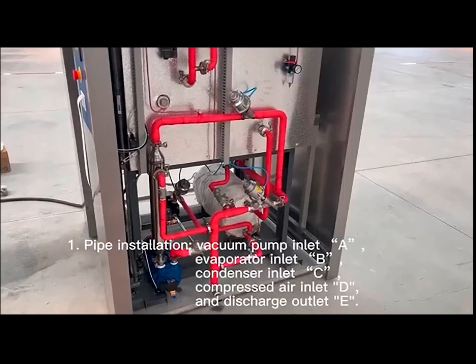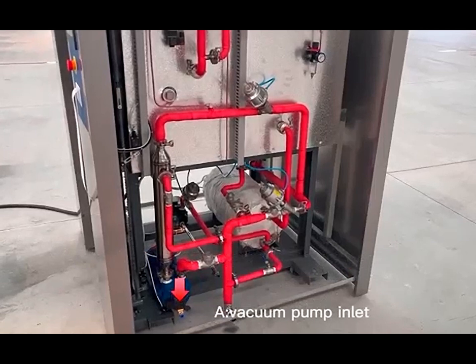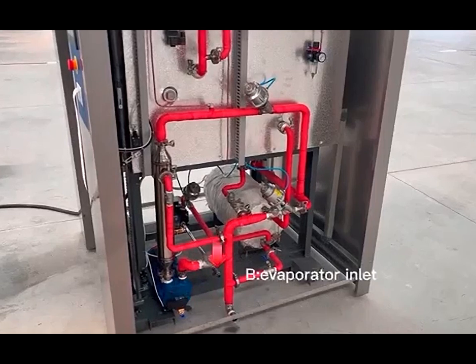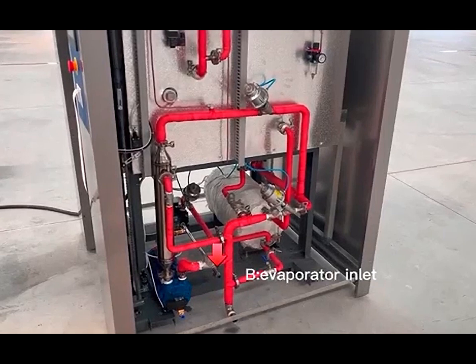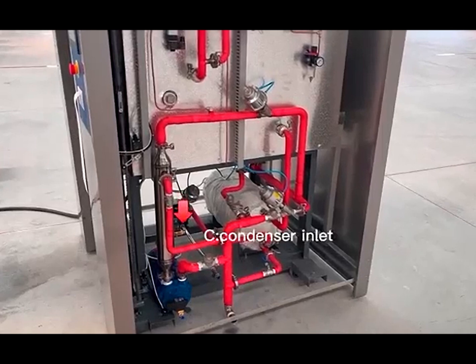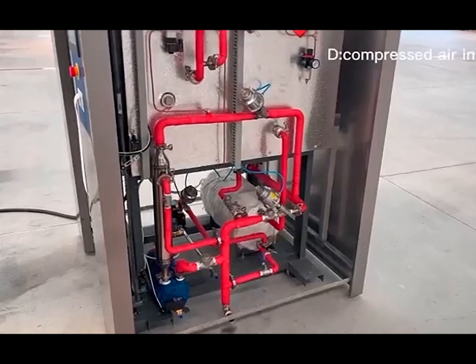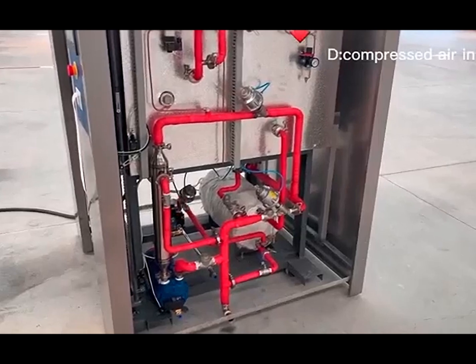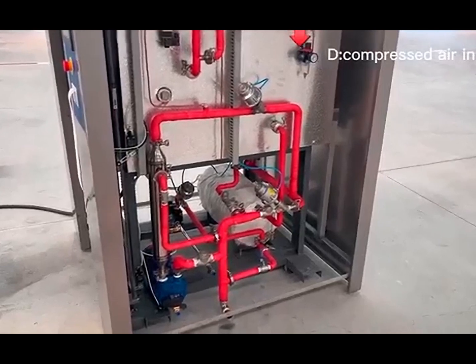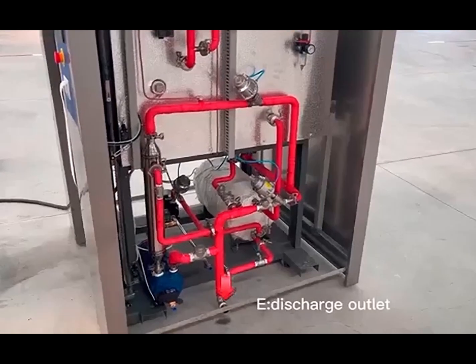Pipe Installation. The key connection points are: Vacuum Pump Inlet, Evaporator Inlet, Condenser Inlet, Compressed Air Inlet, and Discharge Outlet.